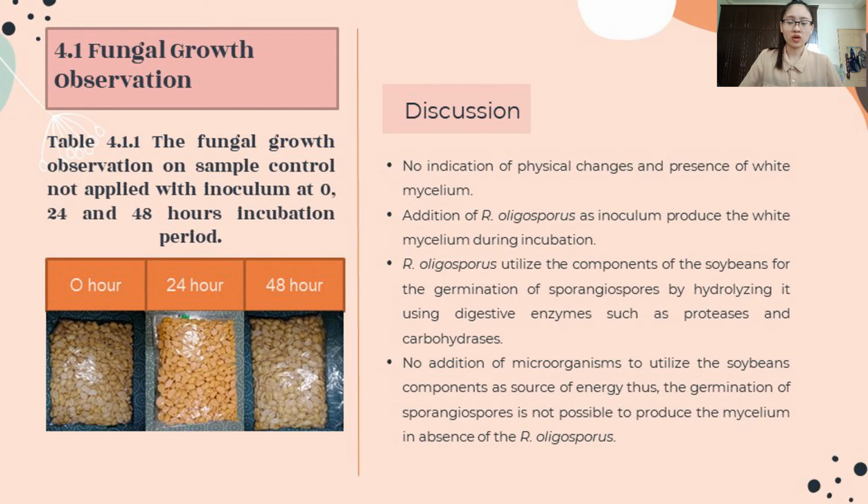Table 4.1.1 shows the fungal growth observation on the control sample, not applied with inoculum, at 0, 24, and 48 hours of incubation period. There is no indication of physical changes and presence of white mycelium. The addition of Rhizopus oligosporus as inoculum produced the white mycelium during the incubation.